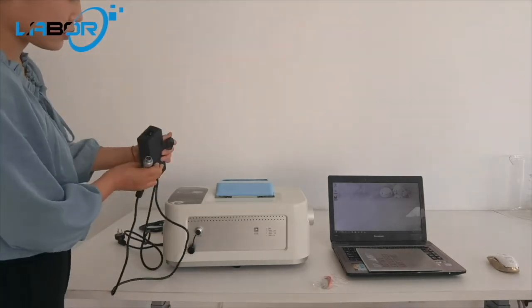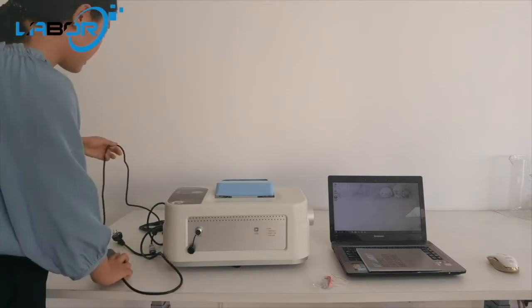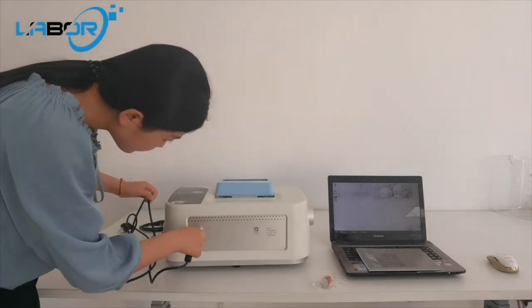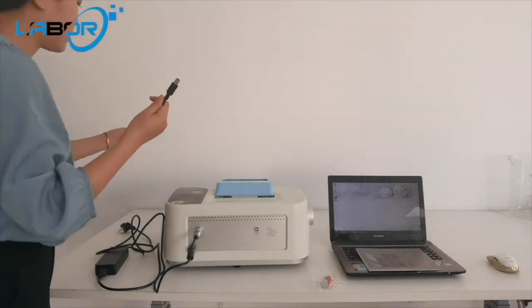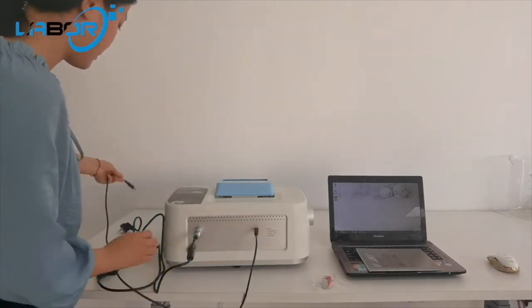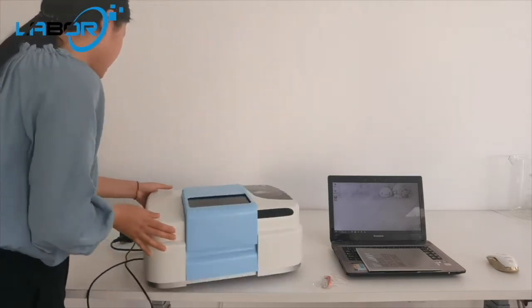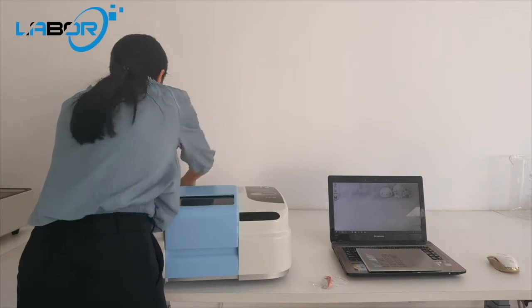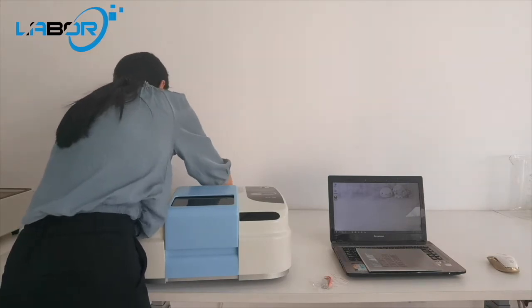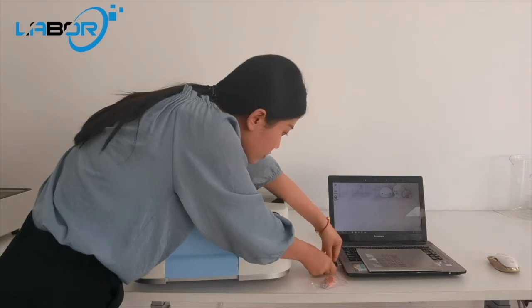Connect the power adapter first. Then connect the machine. Connect the USB cable to the computer.